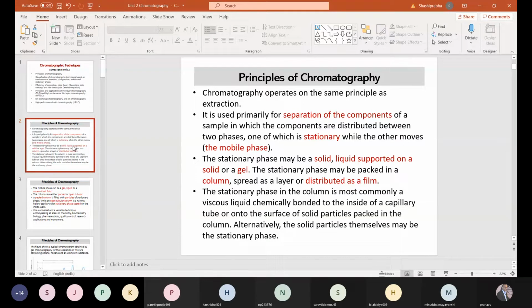Silica is widely used, it is widely available, relatively inexpensive. But the problem with silica is that it is highly polar. That is what we understood last time. Silica is highly polar. So people naturally would do some modifications on it so as to make it more stable. It should not be very reactive. When we say stationary phase which is silica, which is bare silica, that means unmodified silica.